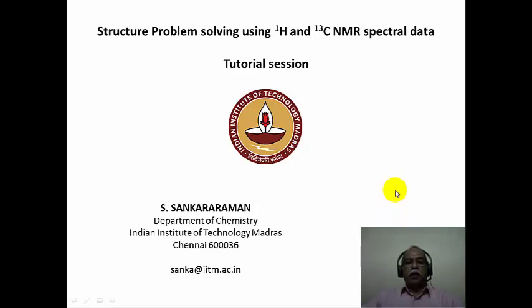Hello, welcome to module 10 of the course on application of spectroscopic methods in molecular structure determination. We will take this as a tutorial session. We'll try to solve some structural elucidation problems using proton NMR and carbon 13 NMR spectral data. We'll also have a look at how the data is presented when it is presented in the numerical form and also when it is presented in the spectral form.